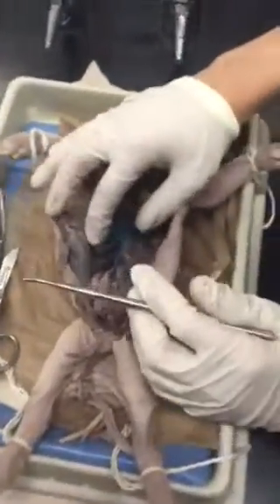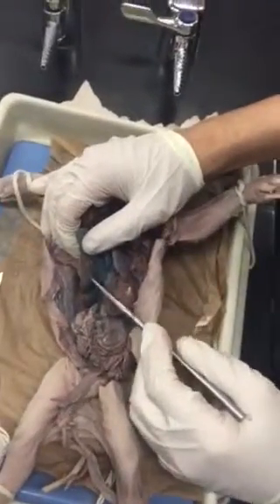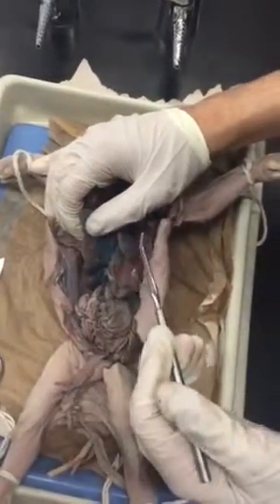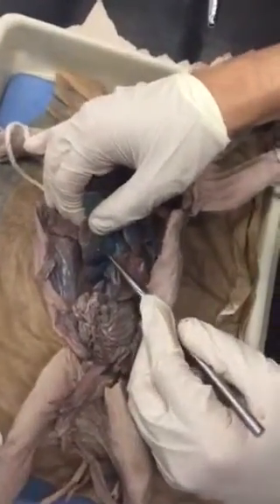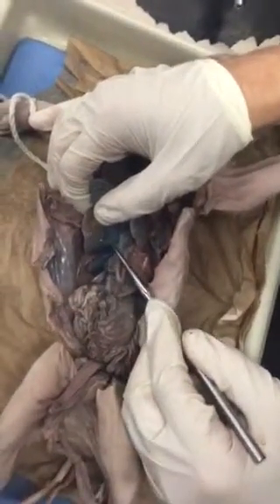Okay. So as we flip the liver up, we see this slightly green tinted thing right here under the liver. And this slightly green tinted thing is called your gallbladder. Bile comes from here. And directly connected to the gallbladder is this small, very hard to see little part right here.